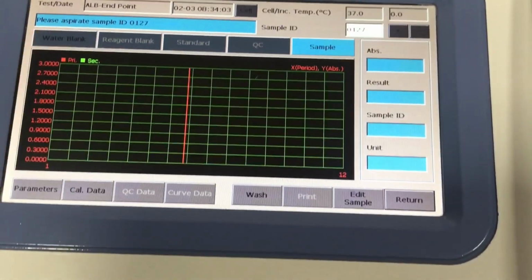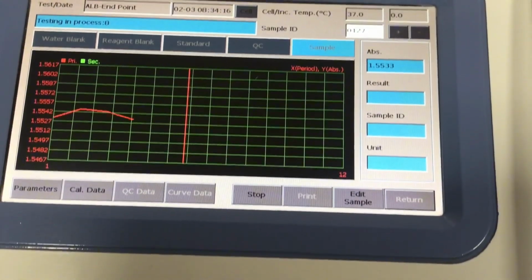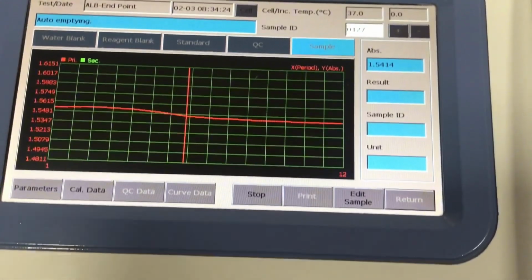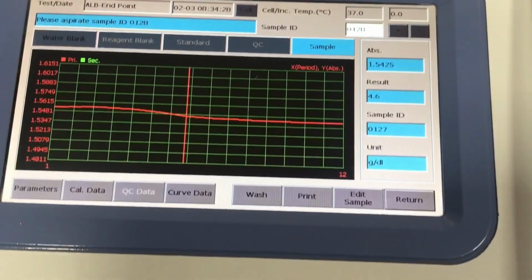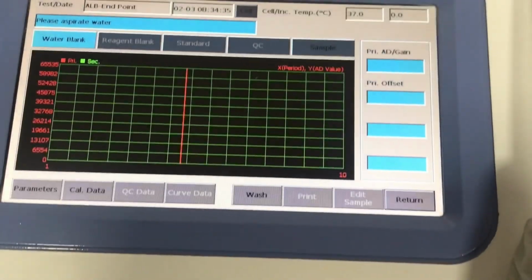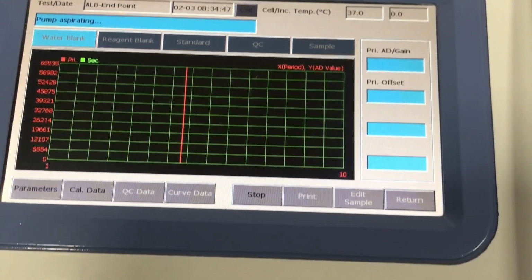Okay, so I'm measuring number 9. So that was 4.6. So let's do number 10. After number 10, I'm going to forward this video.